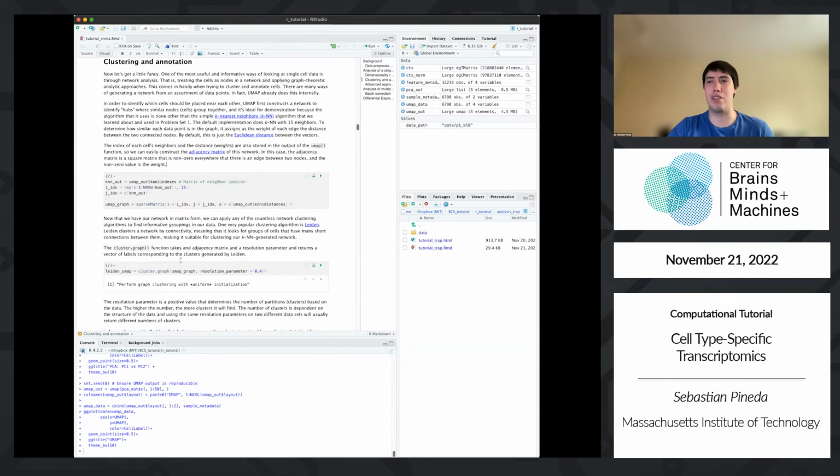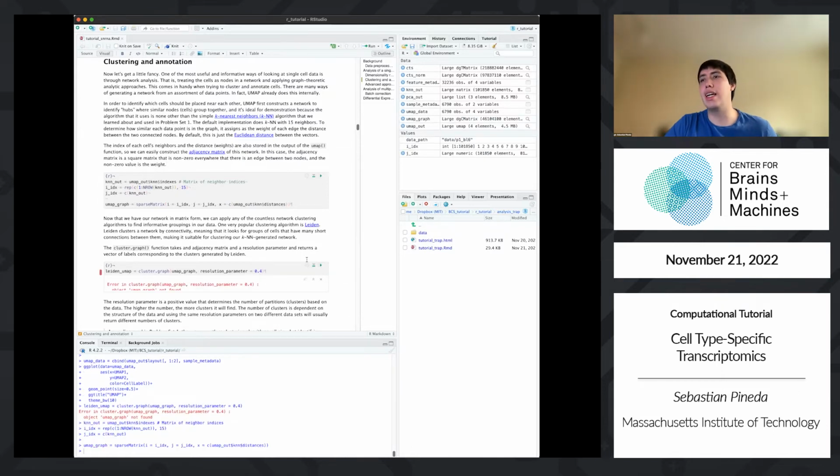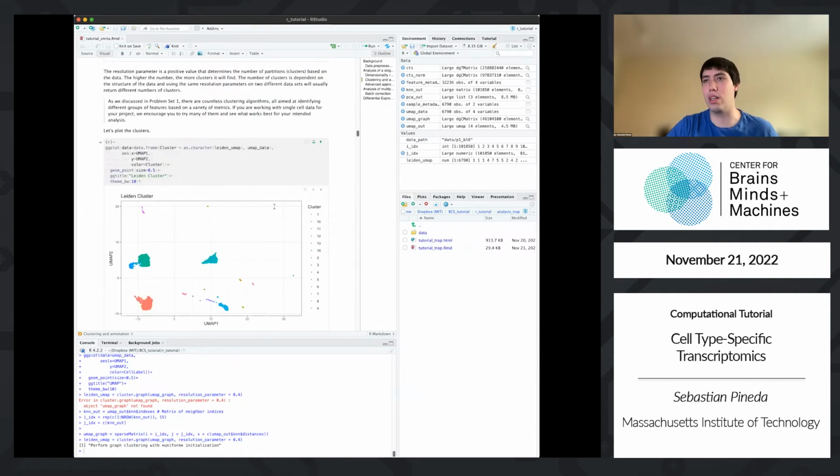And we can apply algorithms like Leiden, which are very popular, which assign, oops, apparently didn't run this. They assign membership. First, it tells you, okay, in your data, there's 10 groups of informative things. And then it assigns every point in your data to one of those groups. And this is what it looks like.